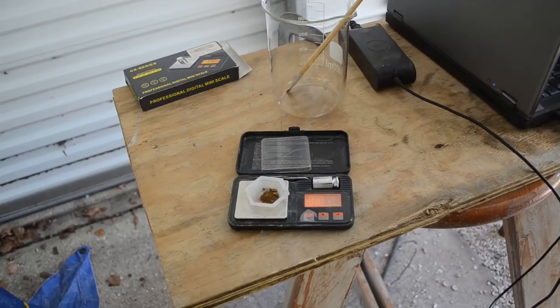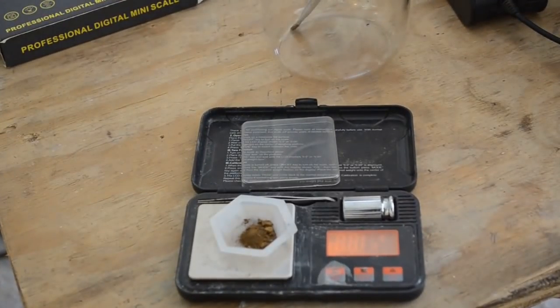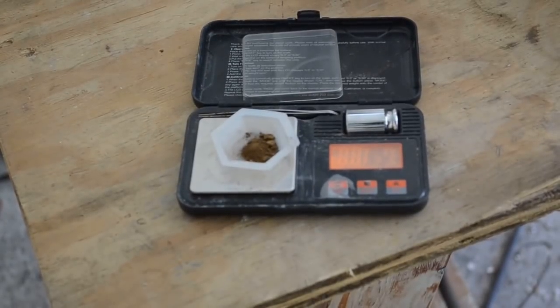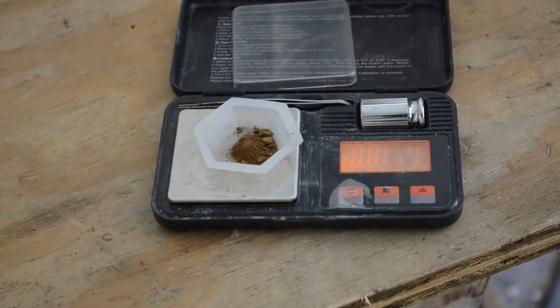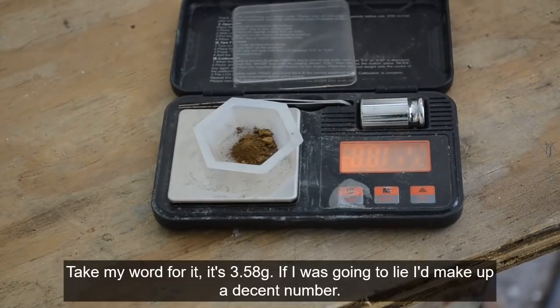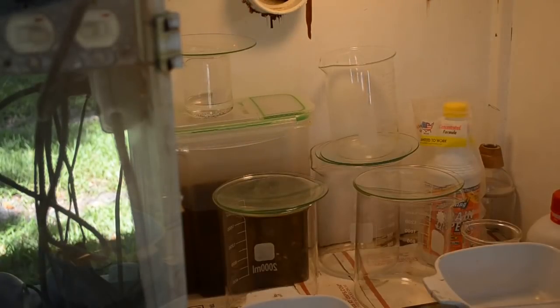Let's talk about some of the issues here that probably could have caused this low yield. I don't know if that's showing up on the screen or not. It's really not showing up on the screen very well, but it's 3.58 grams. All right. Let me reposition the camera. We'll talk about this. So, I know what you're thinking.